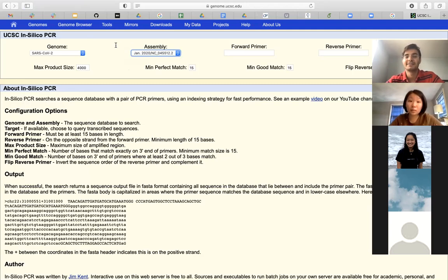Exactly. So that sequence that was assembled, well, in the case of the coronavirus, I don't think there was that need, because there could be. Actually, I am taking back, there could be, because the size is 30K. And I told you that Sanger, the average is probably around 1,000. So you cannot do Sanger doing 30K all at the same time. So there needs to be assembly.